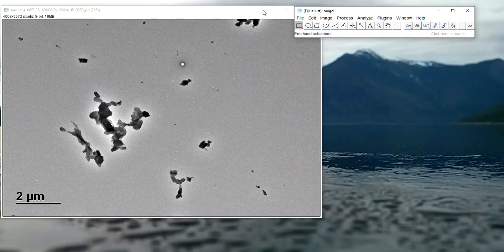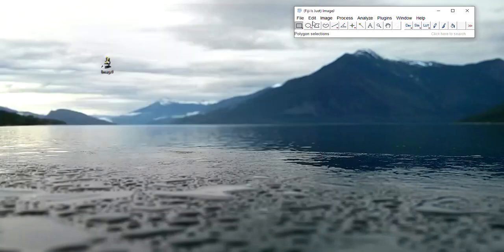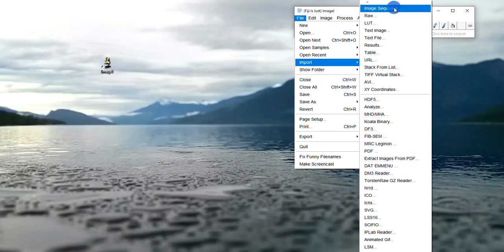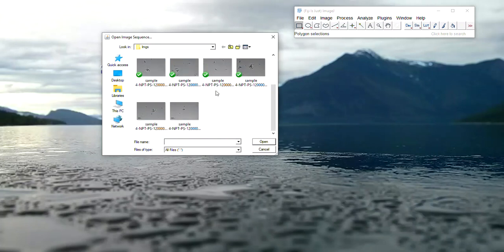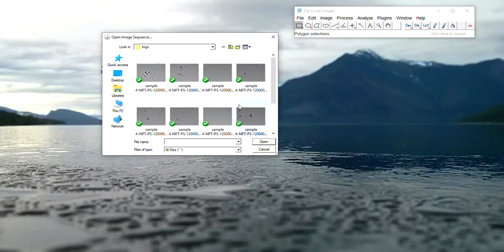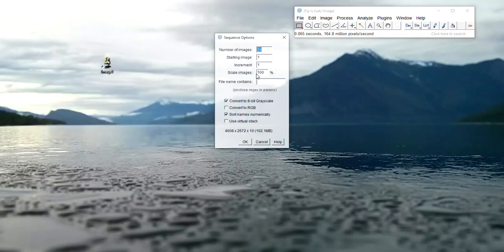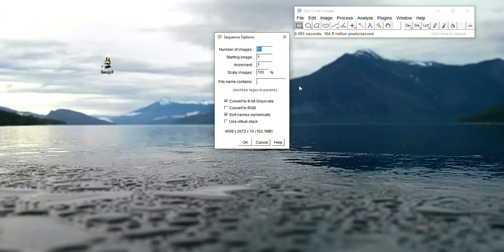Or if you're going to analyze several pictures, you can do another method, which is import image sequence and choose a folder with your images. By clicking on one picture, it will upload all the pictures in that folder. Here you want to make sure that you convert all your images to 8-bit grayscale, which will do it to all of the images.